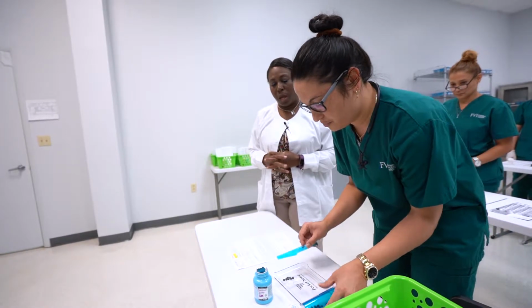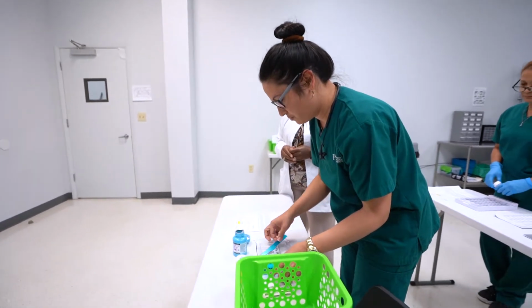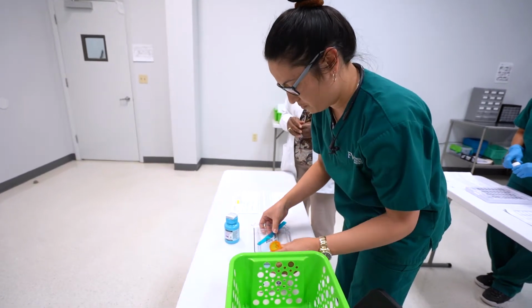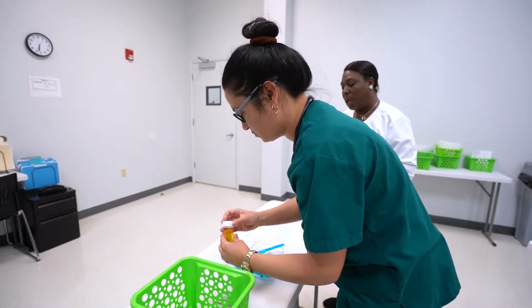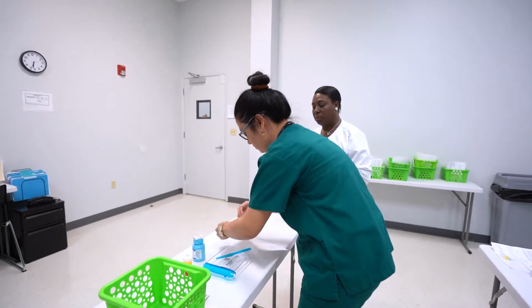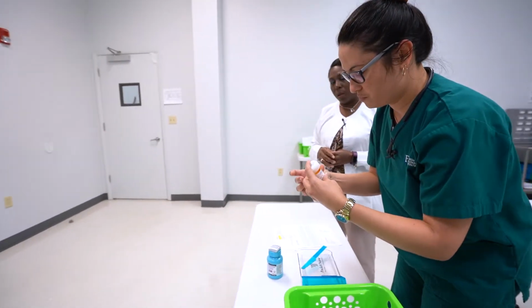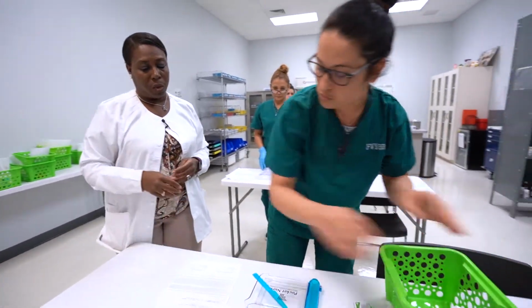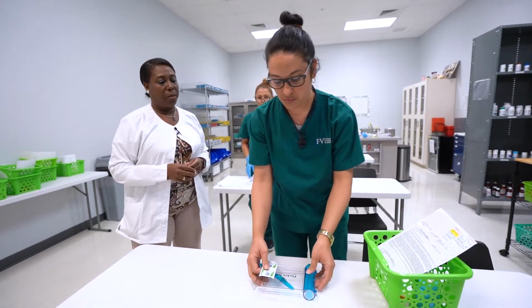And after she's counting that, she will now put the remainder back in the bottle. And then she's going to put the pills that she's counted into the prescription bottle. Then the next step is to apply the label. Now, after she's applied the label for this prescription, she's going to put everything in the basket that she has done, along with the prescription and the label, and she's going to put it in our to be checked area.